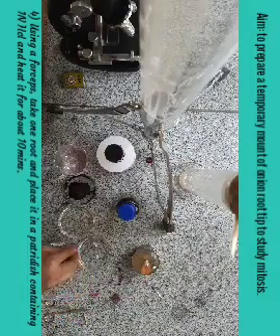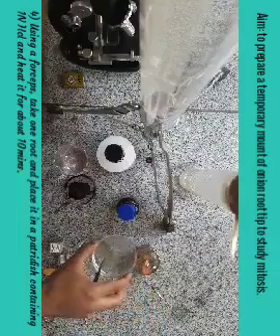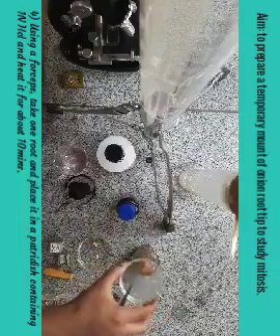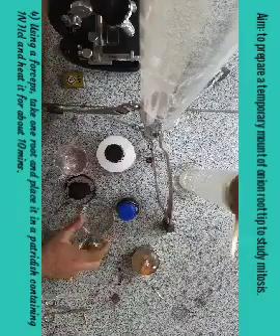Now take one of the root tips with the help of forceps and put that root tip in the one normal HCl. Now heat this HCl for about 10 minutes slightly on a burner, like this. We have to perform this procedure for about 10 minutes.